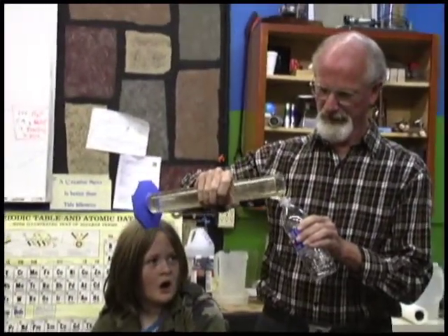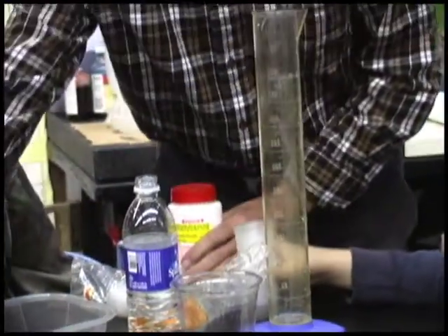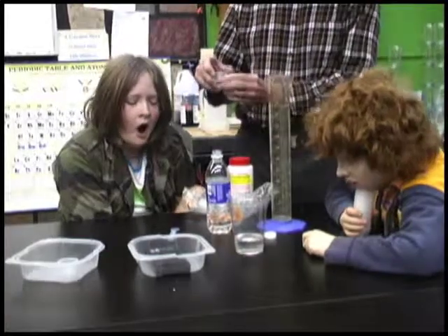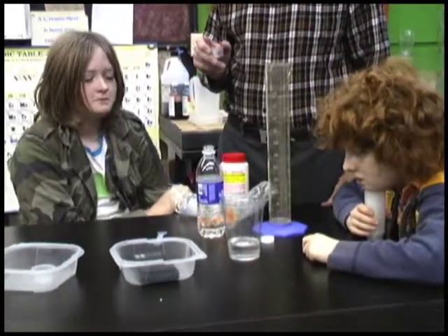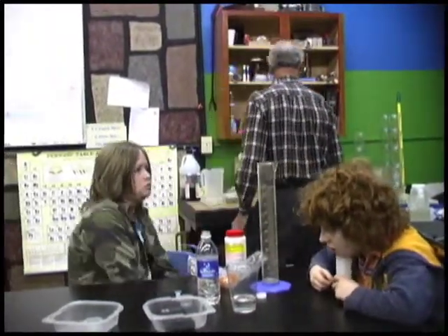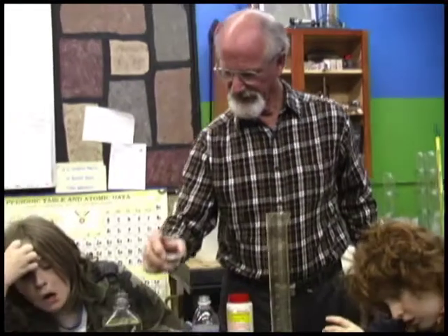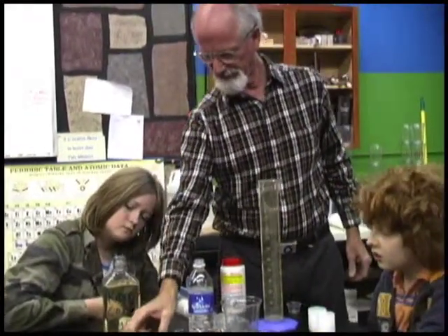Now, you got to put it back in the bottle. And you'll scoop out some lye from here and pour it into there. When you get 1.8 grams of it, then you're going to take this and pour it into your bottle. Once you got it in there, you're going to add some corn syrup. This has got fructose. Then you got to get that to go into the bottle, and you can pour and see how much of that goes into the bottle.